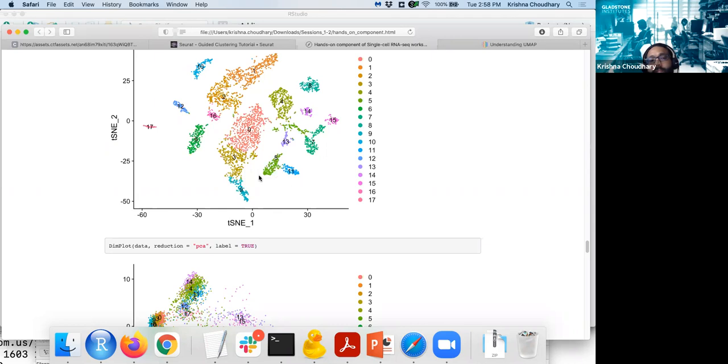Genes that are along the same trajectory path will have correlation with the pseudotime that these tools will give you, and based on those correlations you should be able to identify them. That will be my first guess, but there may be other approaches.